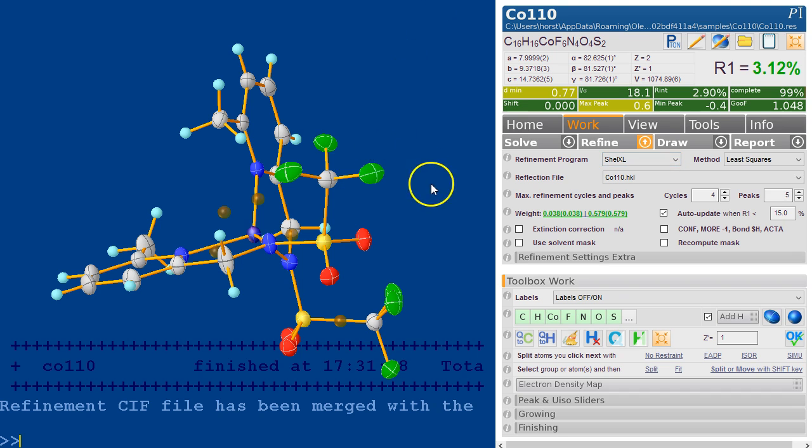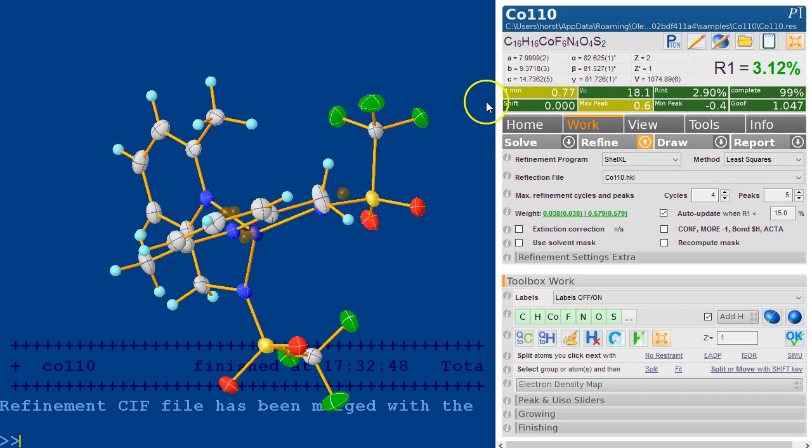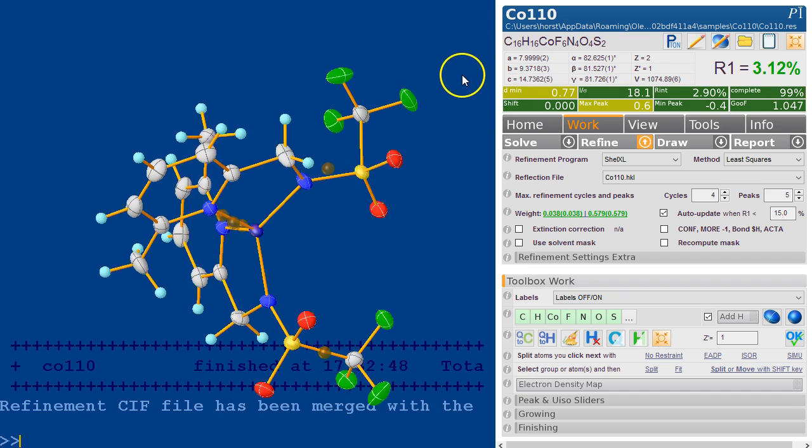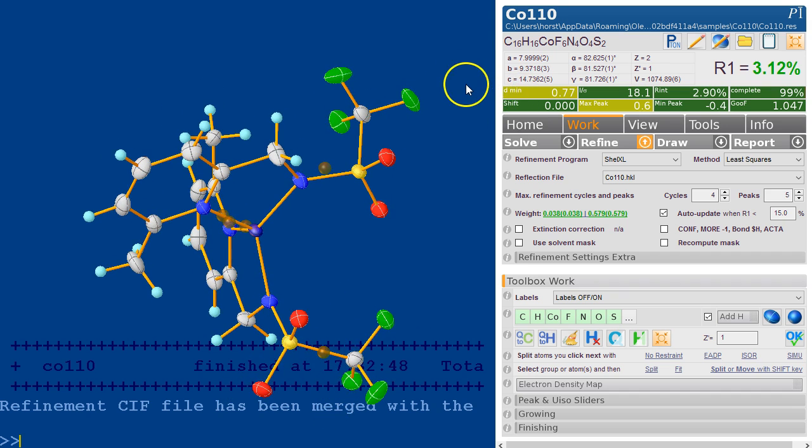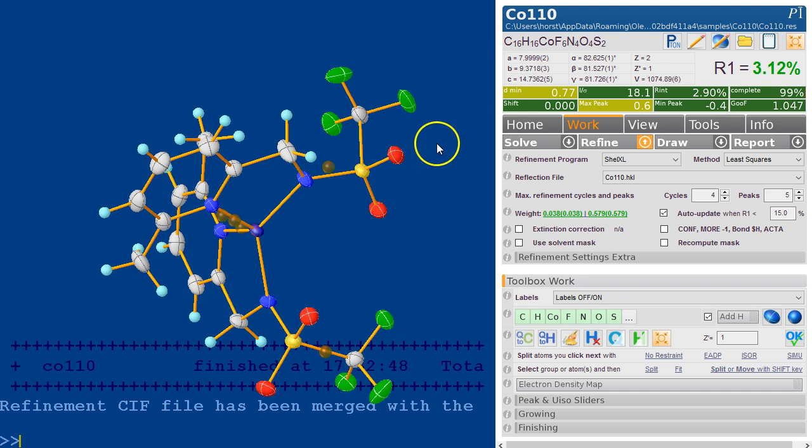What's happened here is we press refine. It refines it. A RES file is generated in the temporary folder and that's copied back into the outer folder. What's displayed here is effectively the result file as an INS file. There is no need to copy RES to INS or do any of those kind of things.